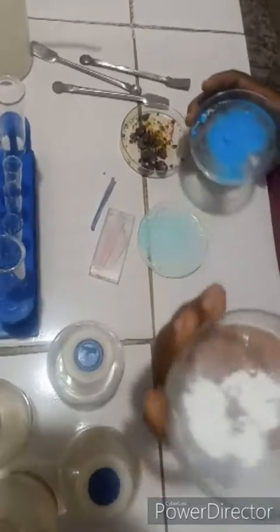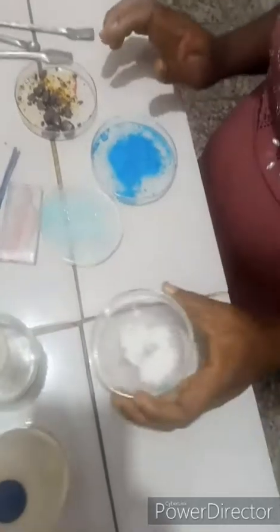you can do preliminary tests. I have samples of salt here. The color of a salt can give you an idea of the cation present in it. For example, the first sample in my hand is a colorless, white salt. This salt might likely contain lead 2 ion, aluminium ion, calcium ion, or zinc ion. The second salt in my hand is a blue salt. Most copper salts are blue in color, except copper 2 chloride, which is green. So most of the copper 2 salts are blue in color.